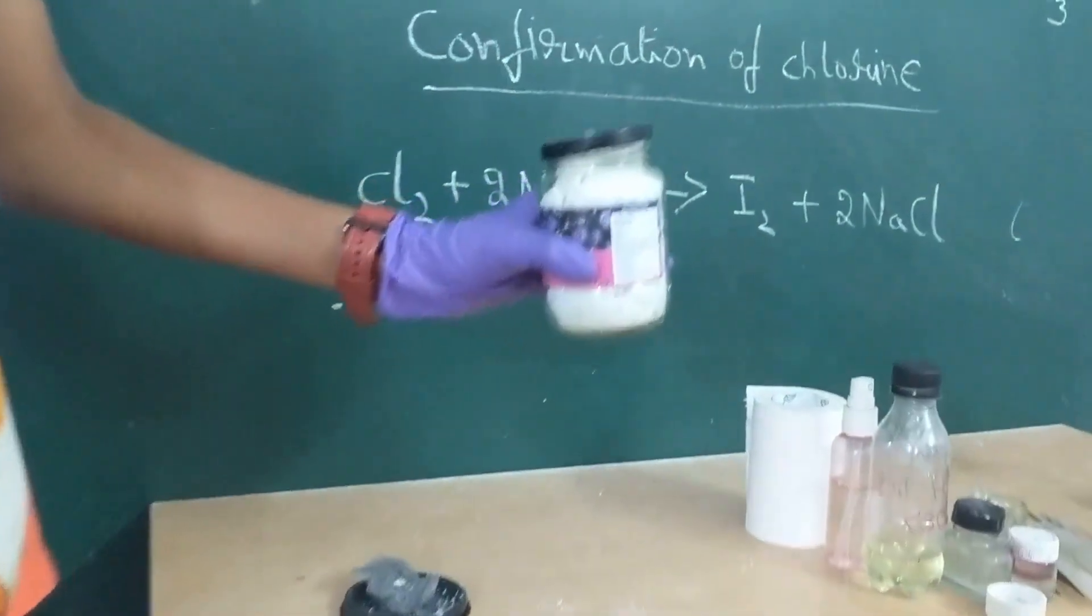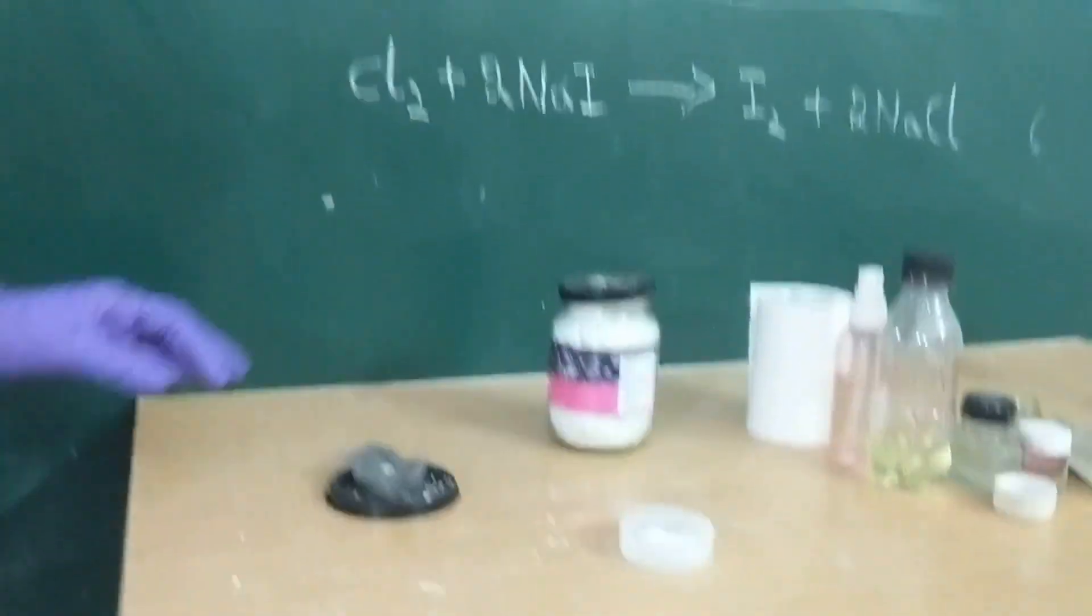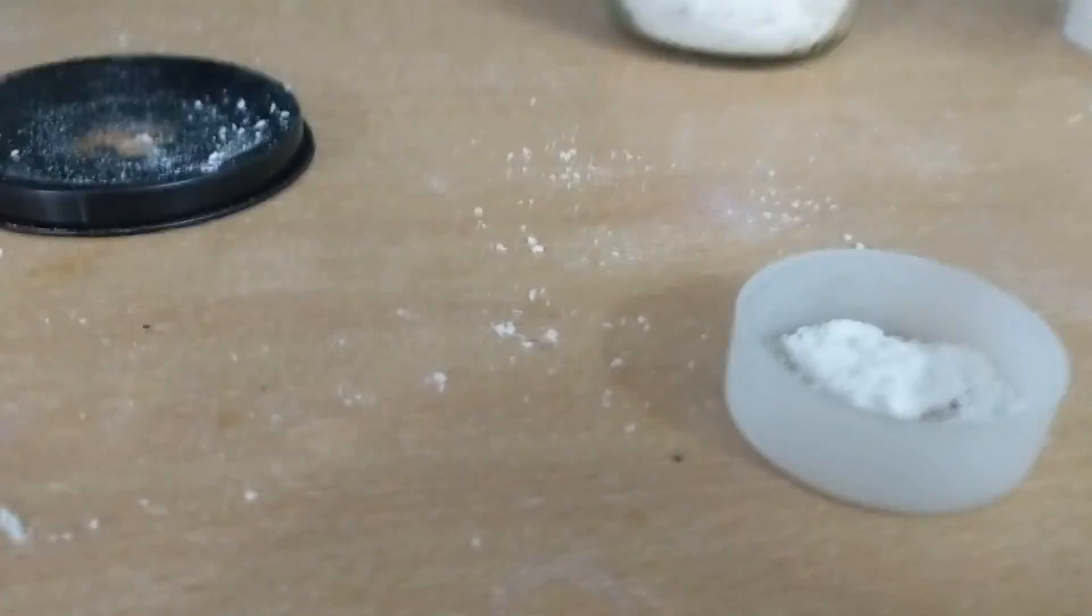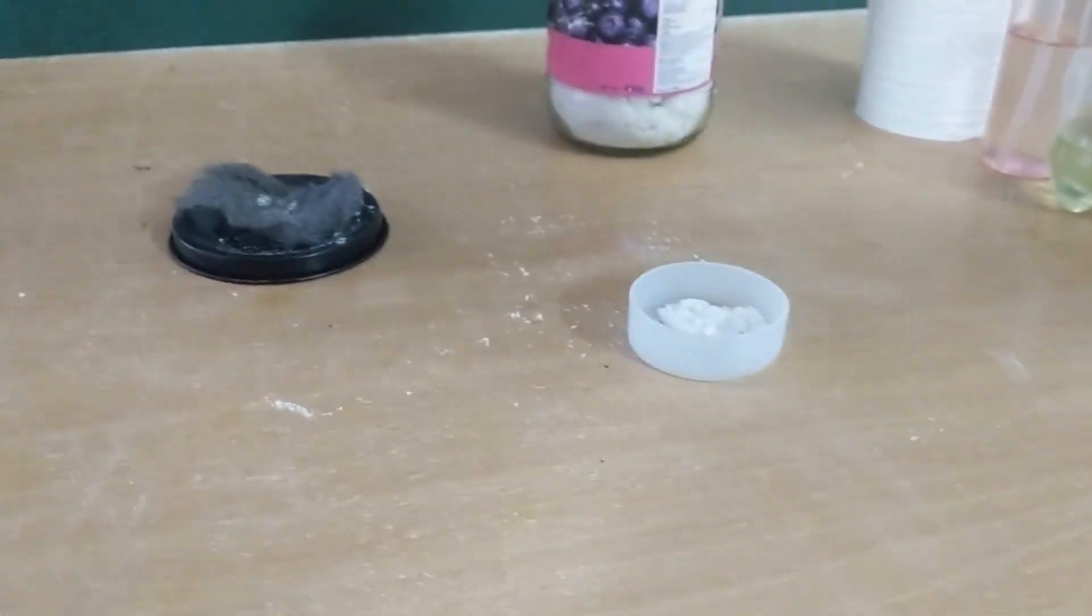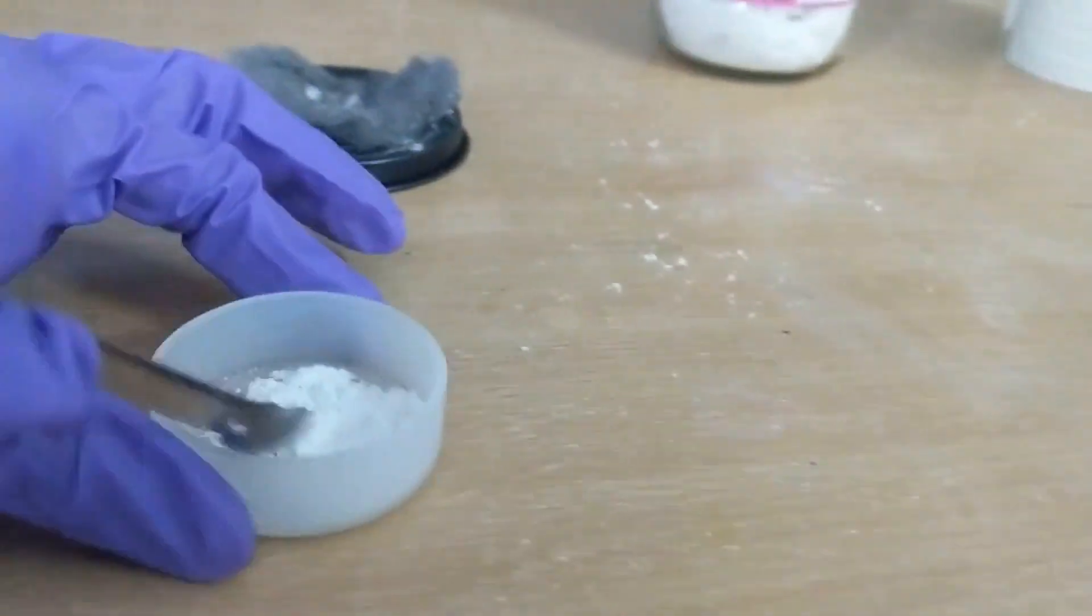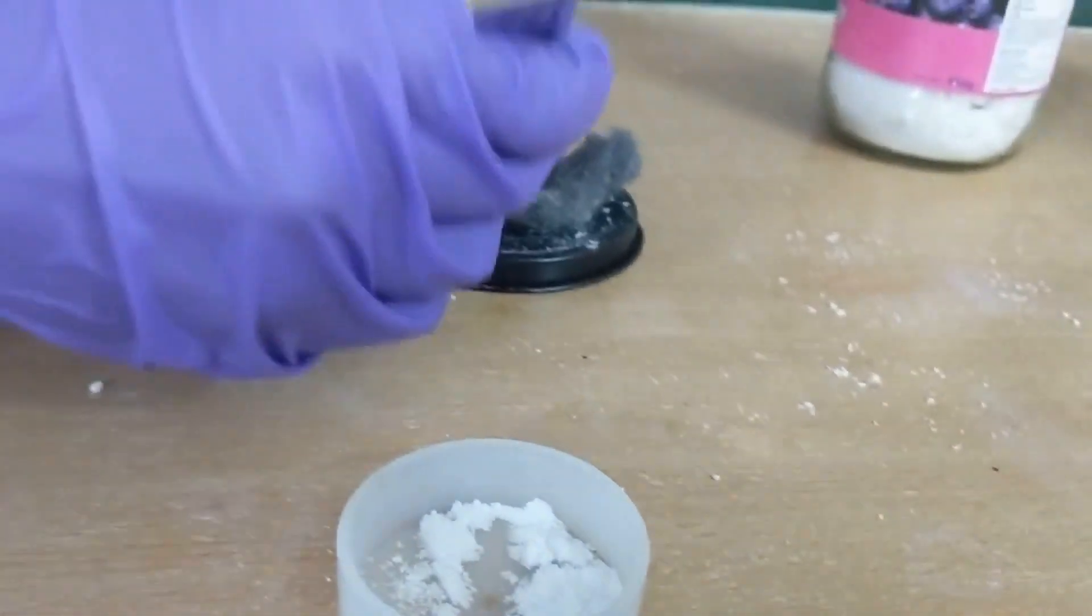This is potassium nitrate and I have placed it in this dish. This is steel wool. Now I am going to take a spatula and place a roughly equal mass of the potassium nitrate on the steel wool.